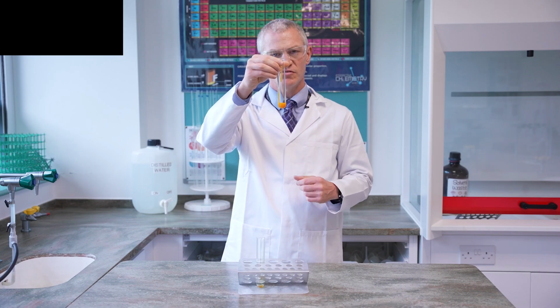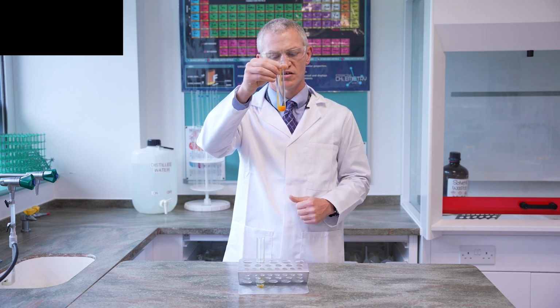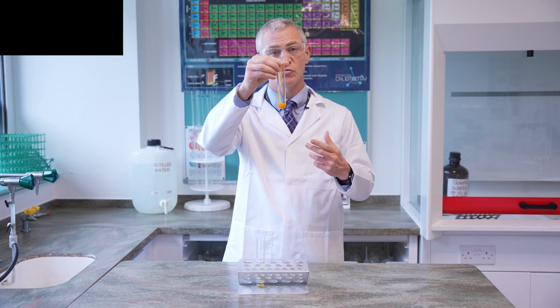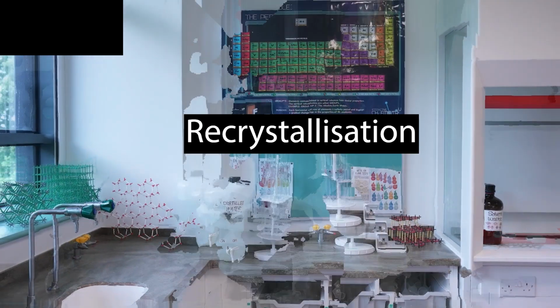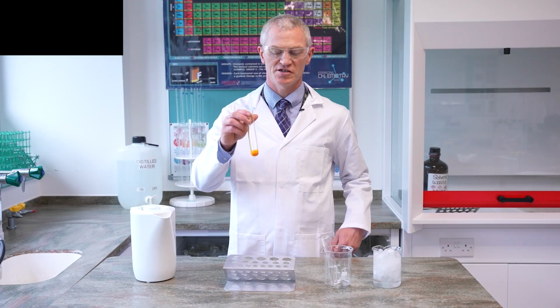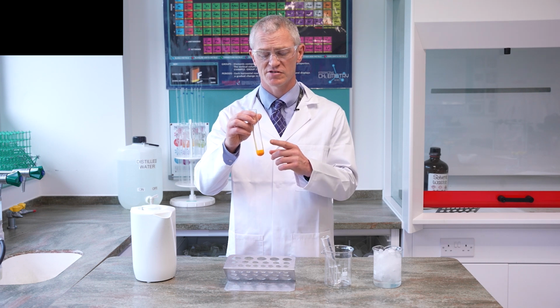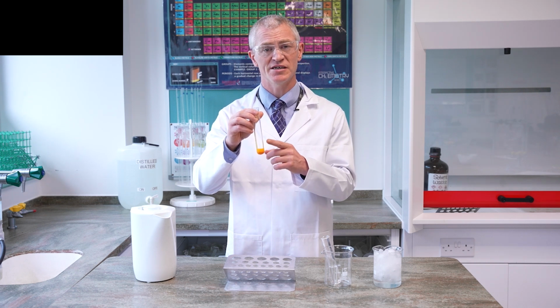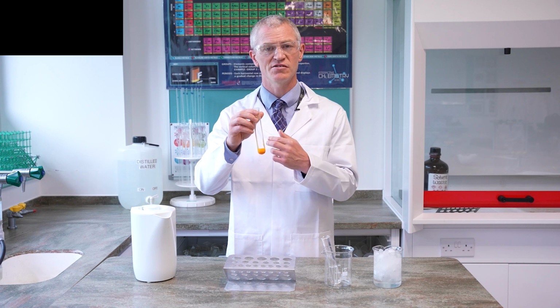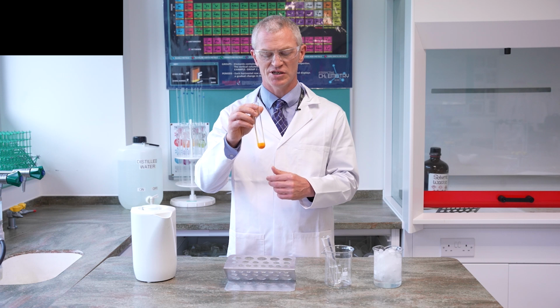So what we can do now is we have to recrystallize this sample to turn it into a purer sample. We're now going to do recrystallization. So you have to describe this in your exams, so it's really important you understand. So here we have our 2,4-DNPH derivative. This is the ketone or aldehyde that has reacted with your 2,4-DNPH.